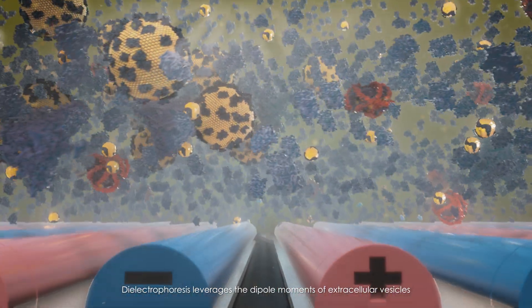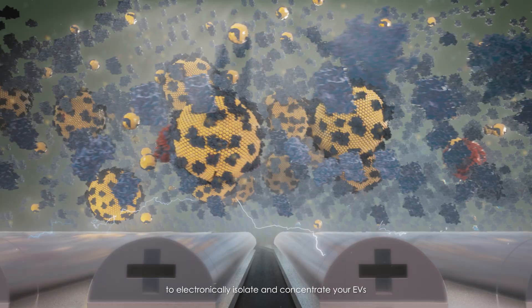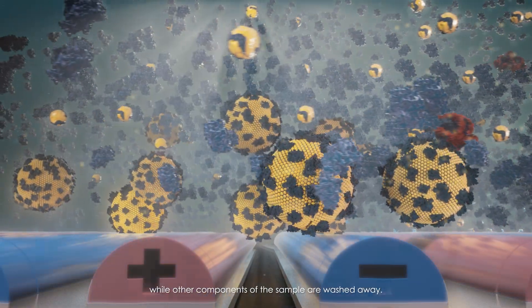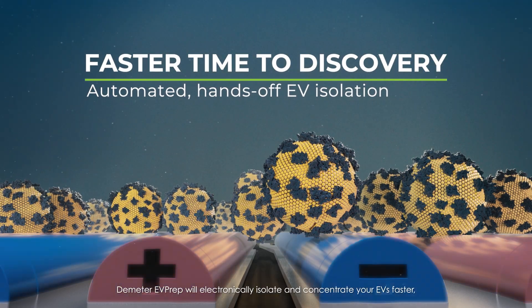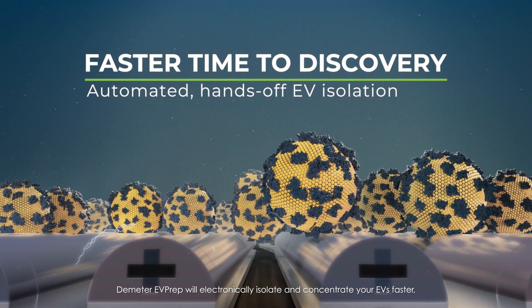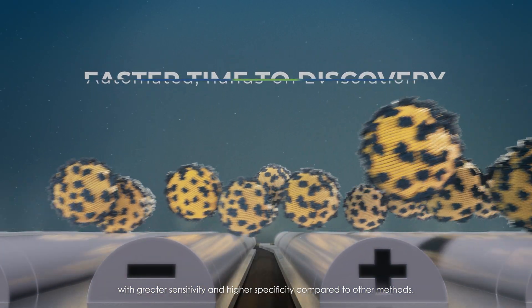Dielectrophoresis leverages the dipole moments of extracellular vesicles to electronically isolate and concentrate your EVs while other components of the sample are washed away. Demeter EVPREP will electronically isolate and concentrate your EVs faster with greater sensitivity and higher specificity compared to other methods.